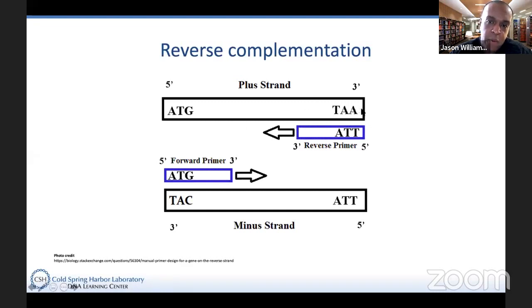Then as you extend, you typically get reads up to 1,000 base pairs, maybe a little more, but that's usually as long as they go. Because it's a probabilistic process, it's hard for DNA to go 1,000 nucleotides without incorporating one of those dideoxynucleotides we talked about last week. So you get less signal. The signal goes down as you get towards the end.